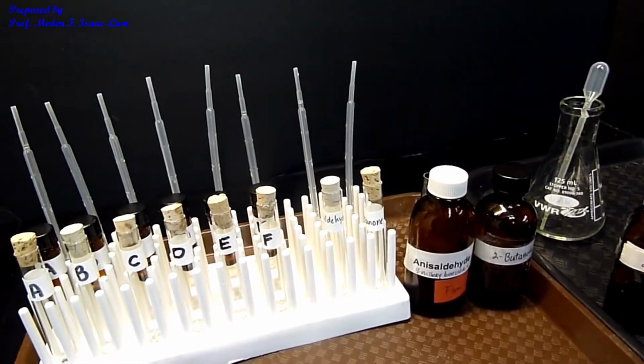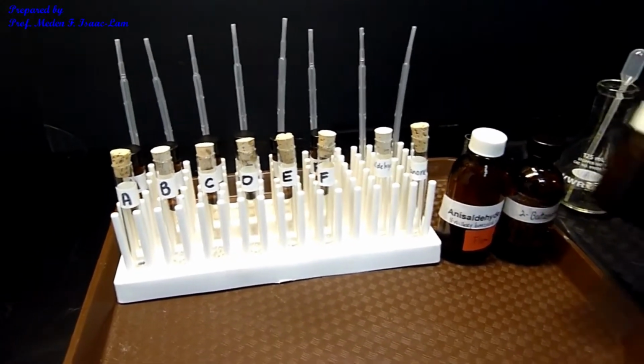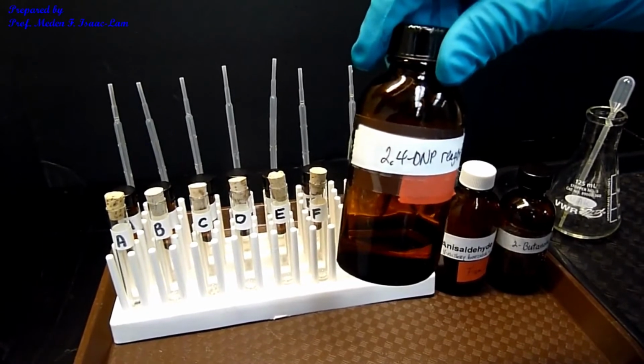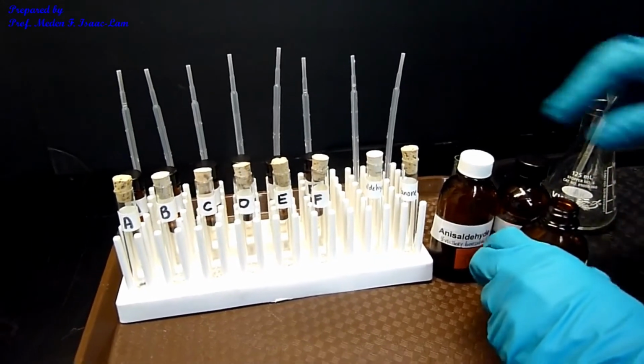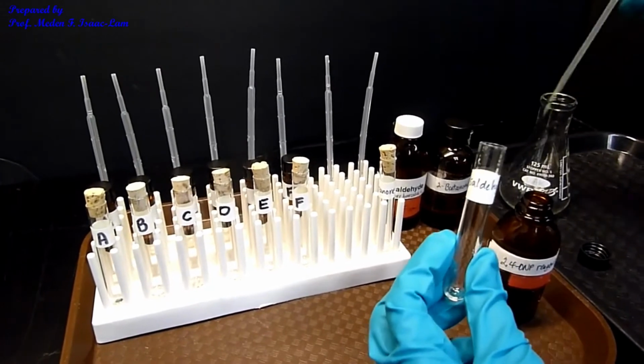I already put 3 drops in each of the tubes, and now I'm going to add the reagent, which is 2,4-dinitrophenylhydrazine reagent. I'm going to add 10 drops each. First, let's do it on the anisaldehyde, adding 10 drops.